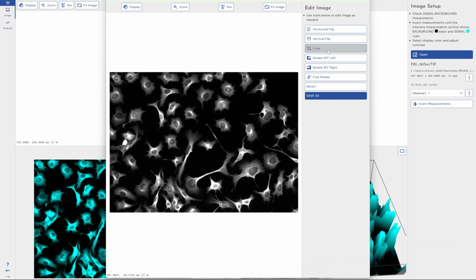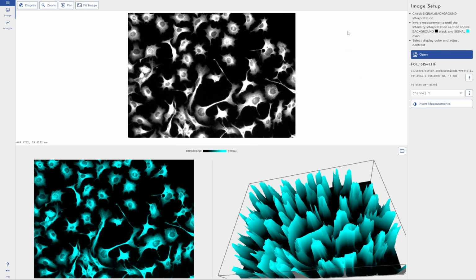So we've got rotates, we've got crops, we've got flips, we've got all the things that you would expect from a simple image editing program. But if you edited this image outside of Phoretix Toolbox in something like Paint, Photoshop, Word even, you would lose that metadata or there's no guarantee of preserving that metadata. So when you came to perform measurements, you might have to get them in pixel lengths rather than in millimeters or inches or whatever your preferred unit of measurement may be.